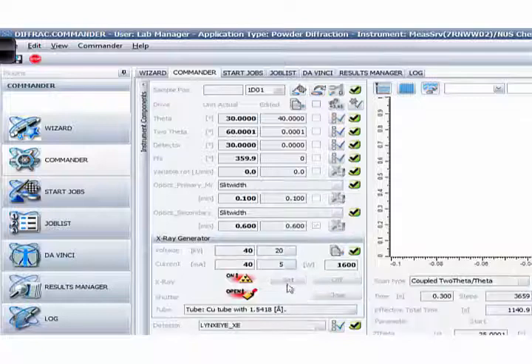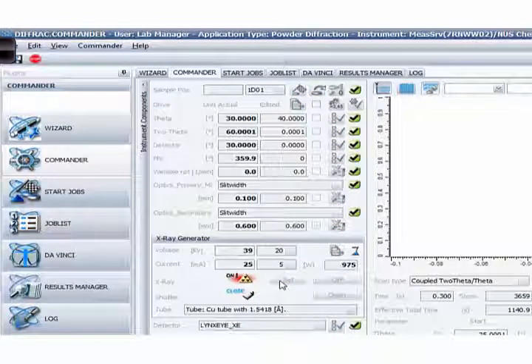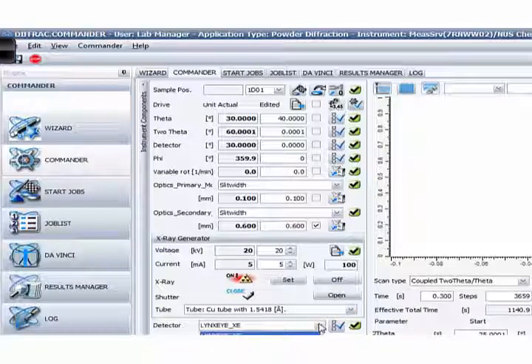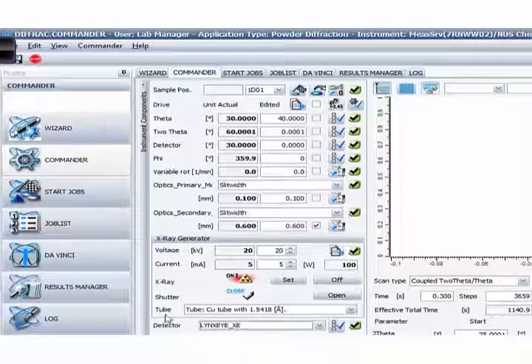Let me set the shutter back and set it back to 25. This is the tube info page — there's nothing you can do with it except read the info from the tube and detector. For the detector, you can choose to run in 0D mode, which behaves as a point detector — but I don't think you'll need it because the purpose is to use the 1D detector.